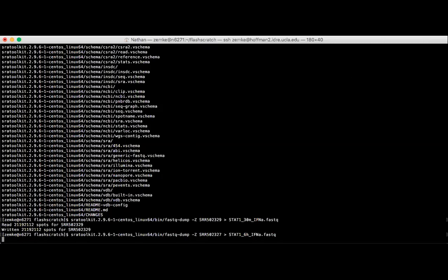I hope everybody can get this to work in some way. Like I said, this is the first time doing this strictly over Zoom, so it's harder to help people when I can't actually see their computers, but I hope this is working out.